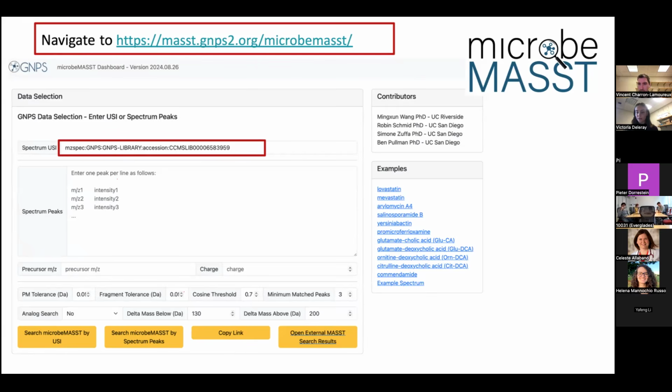The histidine C4 CSV provided is separated by a semicolon, so it's not parsed correctly when reading it in. So this seems like an issue with the naming of the file, and I think that the problem would be corrected if you renamed the file.